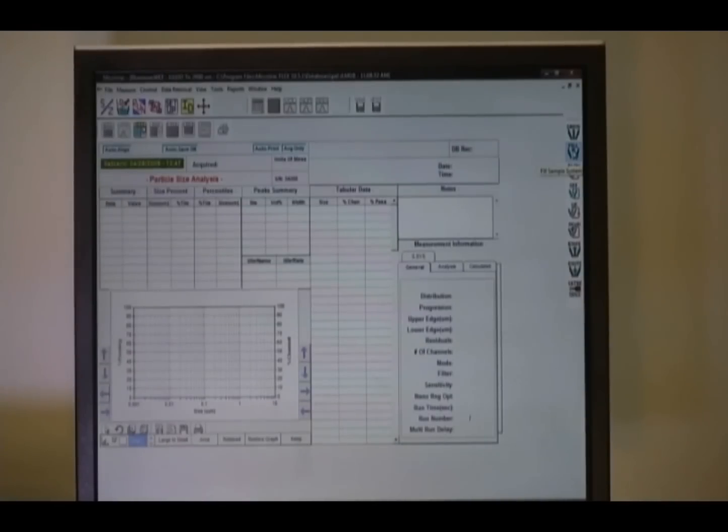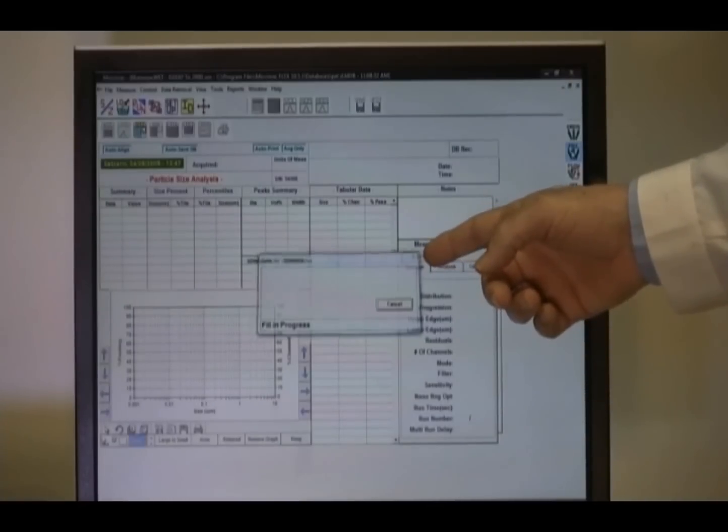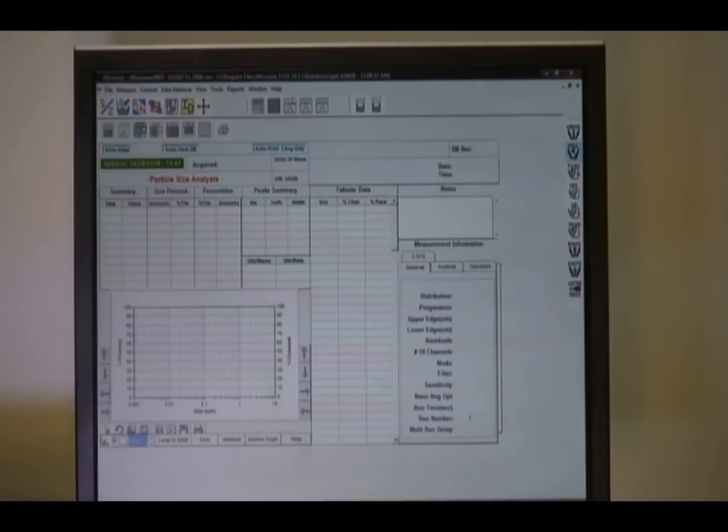The next step in replacing the sample cell to the sample compartment holder is to fill the system. We will want to be sure that having replaced the sample cell, there will be no leaks. The first step in filling the system is to place the cursor over the fill icon. Press the left mouse button and the monitor shows us that a fill is in progress. During this progress, the system entirely is being filled with water. The SDC bowl, all tubing and the sample cell are now being filled with water. The pump will turn on and off a few times to allow for de-aeration. De-aeration assures that any bubbles or air have been removed from the fluid. Bubbles or air in the system will cause a high background or an alignment problem. When the system is completely de-aerated, the screen dialog will disappear and the system is now ready for checking.